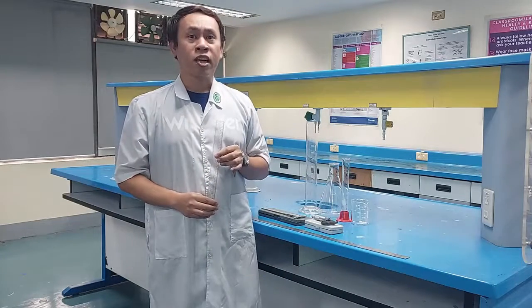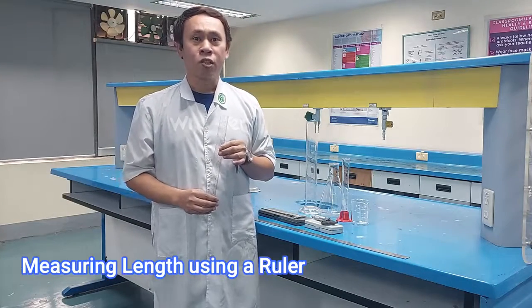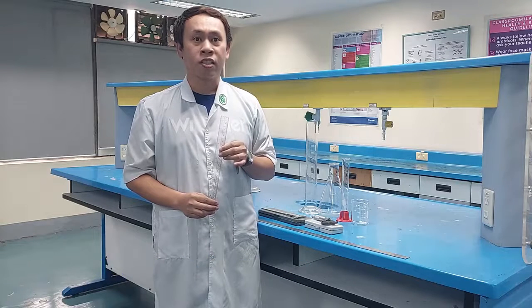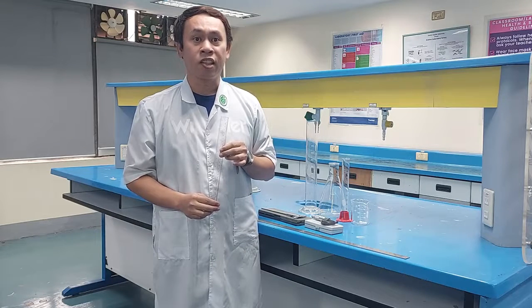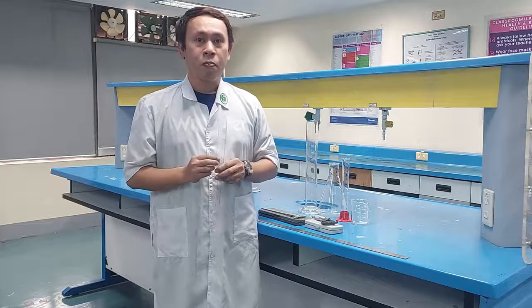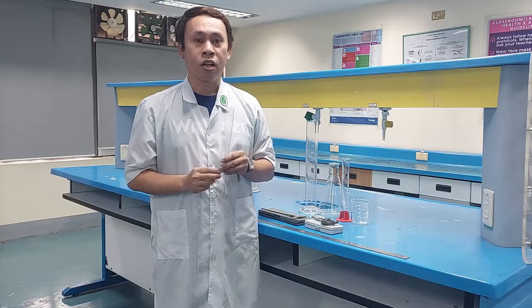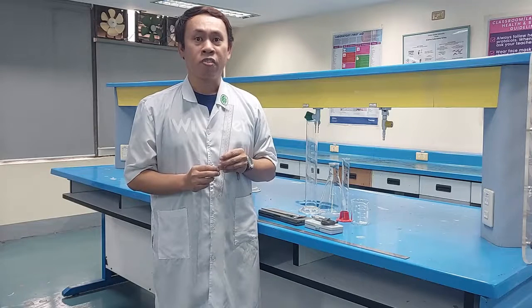Measuring length using a ruler. Use the unit in which you want to measure length. If you want a value in centimeters, then take the centimeters side of the ruler. If in inches, then take the inches side of the ruler. Place the object beside the ruler starting from point 0 on it. Look at the end point and mark the value.